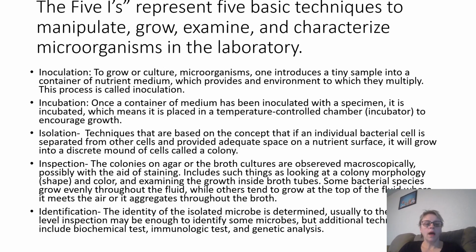And then we have isolation. Techniques are based on the concept that an individual bacterial cell is separated from other cells and provided adequate space on a nutrient surface. It will grow into a discrete mound of cells called a colony.